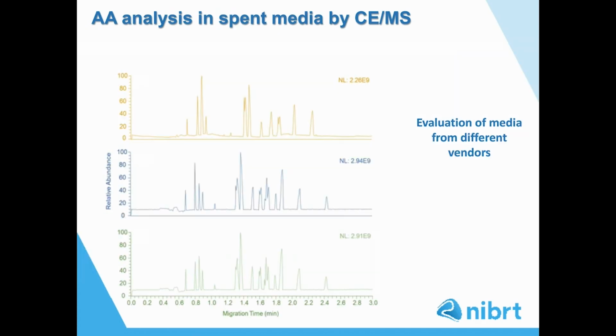First, we tried to monitor media from several vendors, and as you can see from the 3 electropherograms, it is clearly possible to distinguish the amino acid content in each of them.